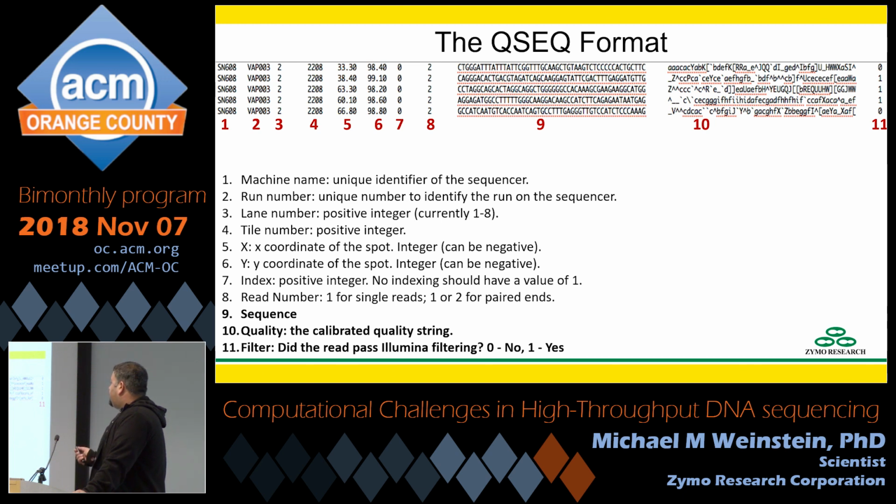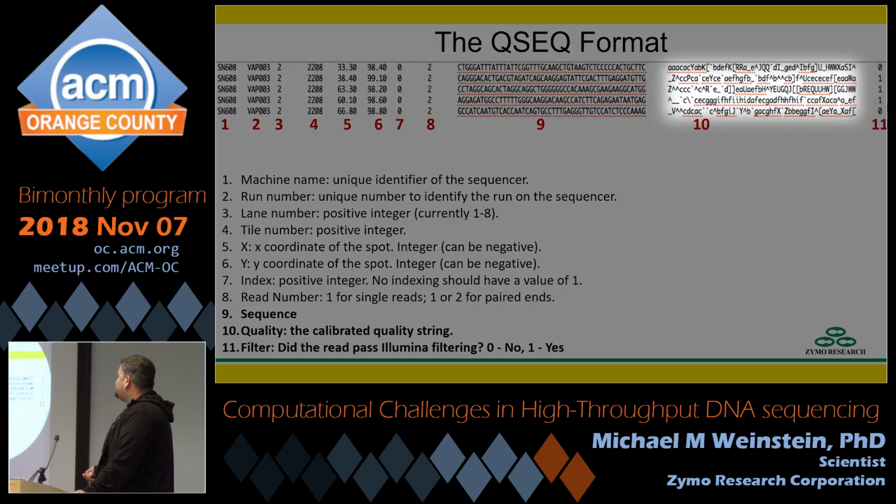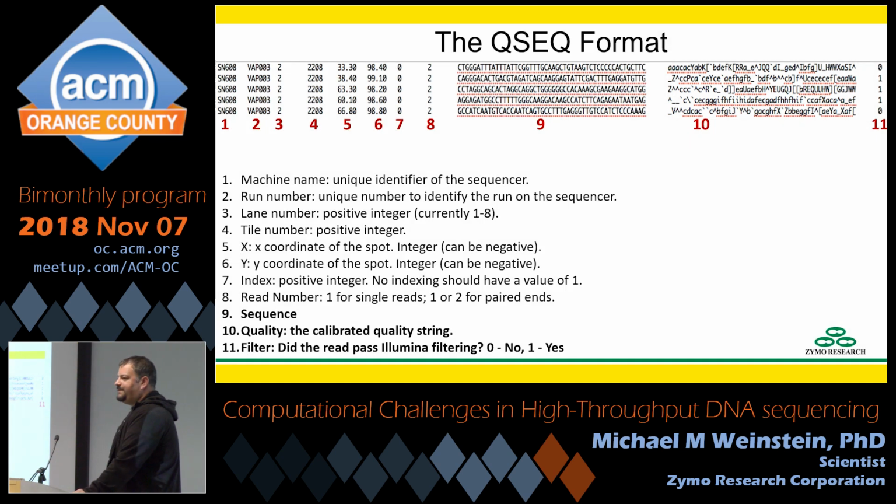Following that, we have the actual DNA sequence, and that's just going to be a bunch of A's, T's, G's, C's, plus either N's or dots, depending on the specific machine, to tell you that it couldn't read a base there. The last one is this set of basically a bunch of weird characters, and that's a quality string. And the way that works is the characters represent their ASCII values, and there's a table for converting that to what's called a Phred score.